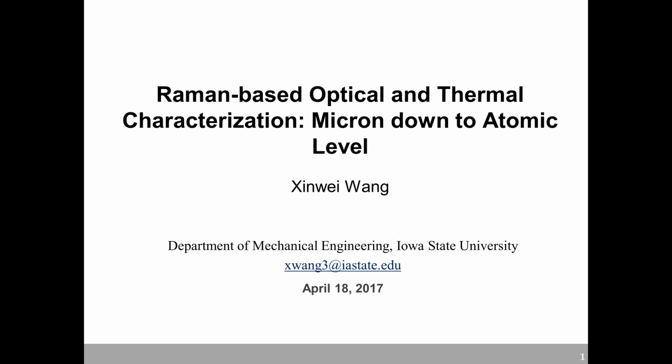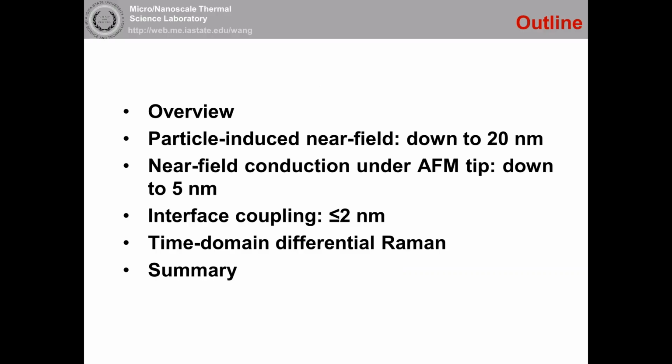Spectroscopy is to study the structure of materials. So we use this technique in the other way, but it's very useful. So this is the outline of my talk. The first is the overview. It's a very simple background to show why we are using Raman spectroscopy for temperature measurement, and what's the advantage, the unique things for this technology. It must be something unique, otherwise, we won't choose it.